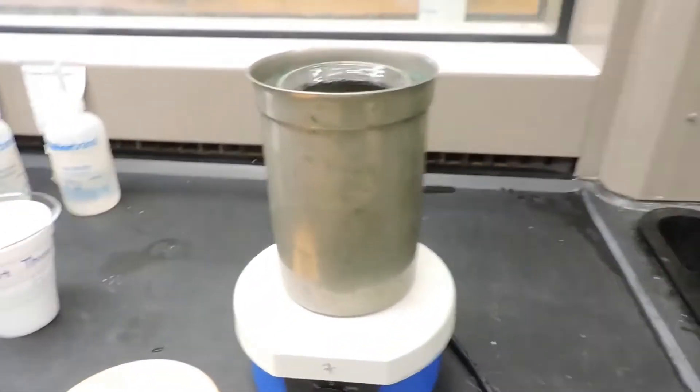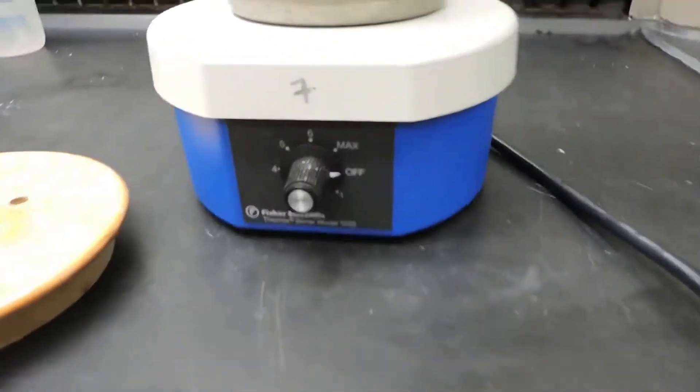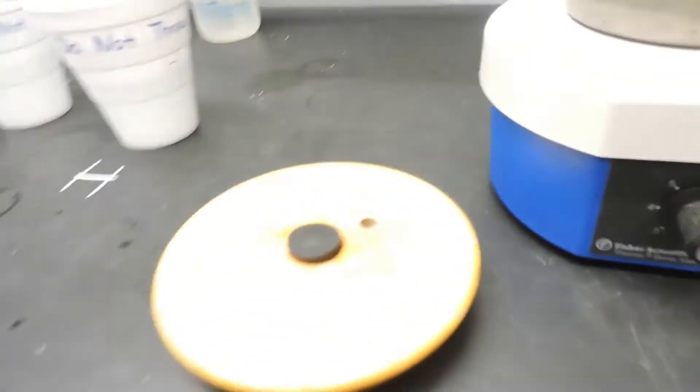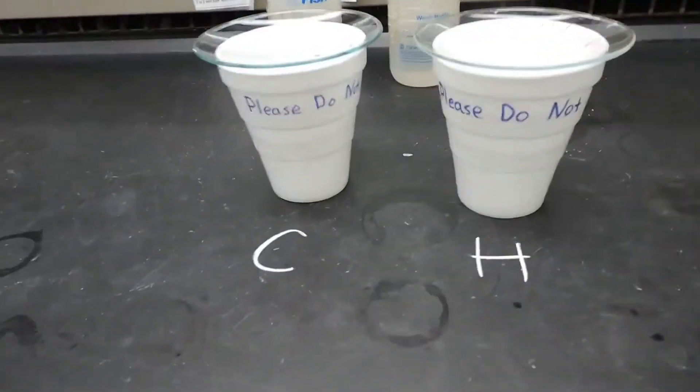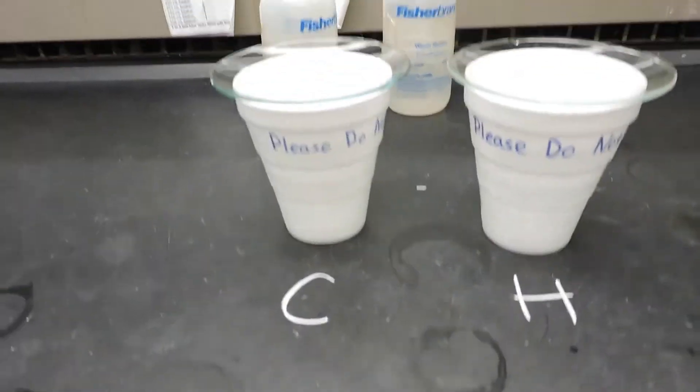On the inside is a stir bar. We have it positioned on a stir plate, and the top is pretty much sealed. It has a rubber gasket here, and there's a hole to put in a temperature probe, which we have here. We also have two styrofoam cups set up. One has cold water and one has hot water.